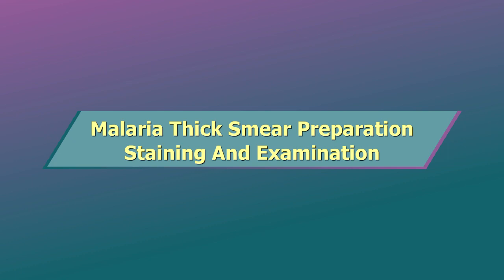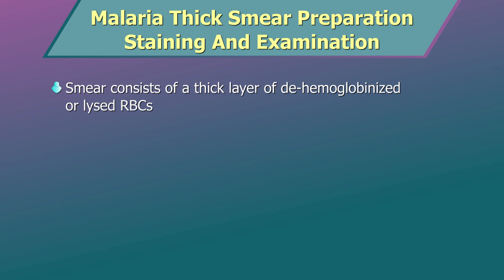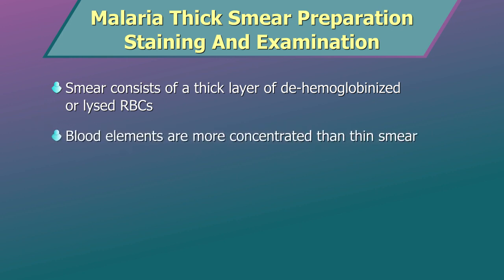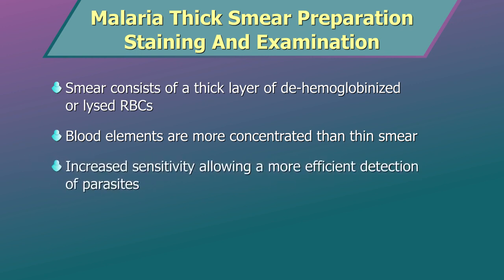Malaria thick smear preparation, staining and examination. Thick peripheral blood smears consist of a thick layer of dehemoglobinized or lysed red blood cells. The blood elements, including parasites, if any, are more concentrated than in an equal area of a thin smear. Thus, thick smears have an increased sensitivity, allowing a more efficient detection of parasites.